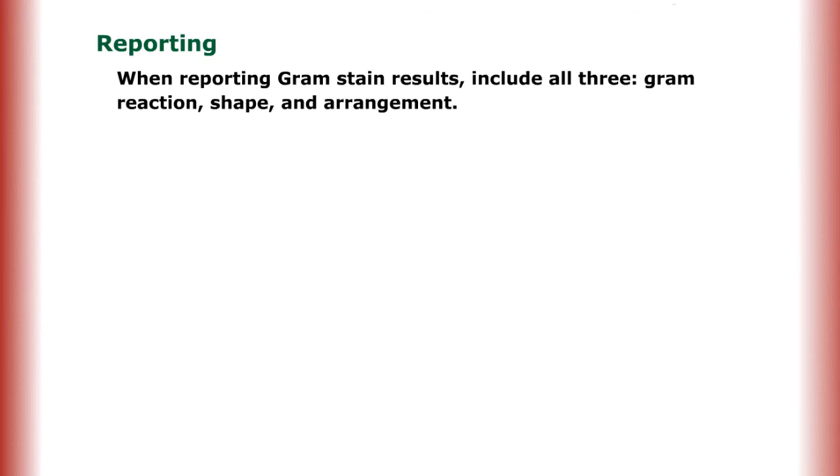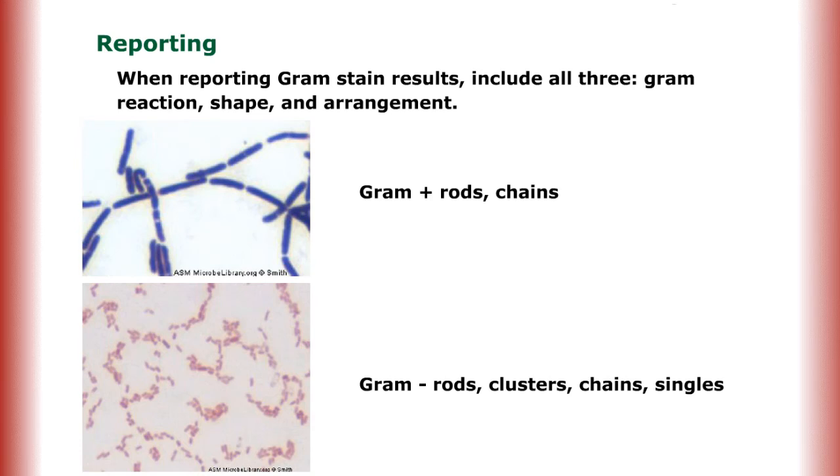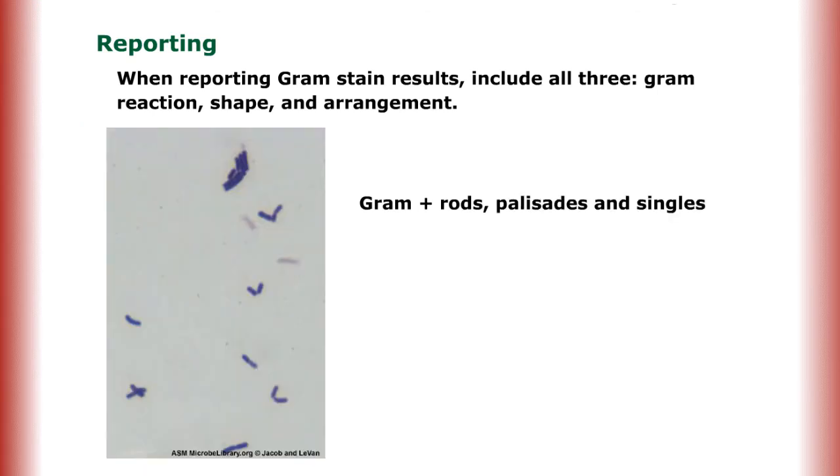Let's take a look. Gram-positive cocci in chains and pairs. Gram-negative cocci in clusters and pairs. Gram-positive rods in chains. Gram-negative rods in clusters, chains, and singles. Gram-positive rods in palisades and singles.